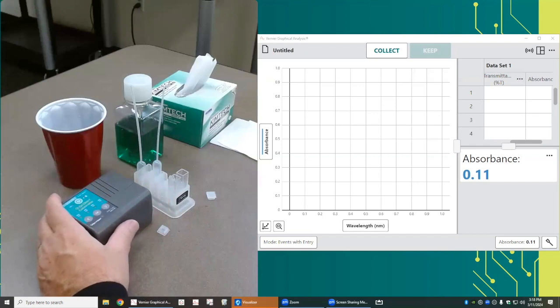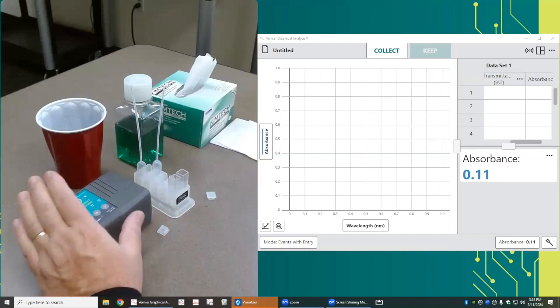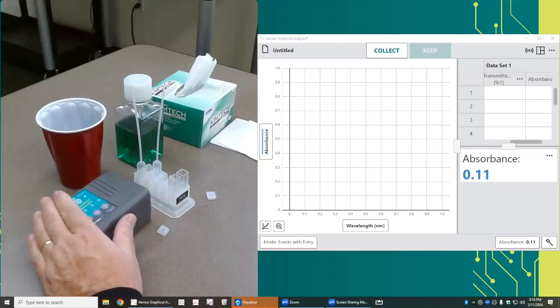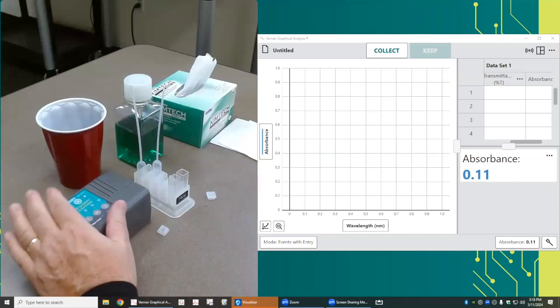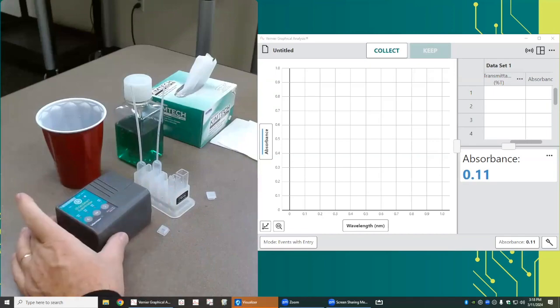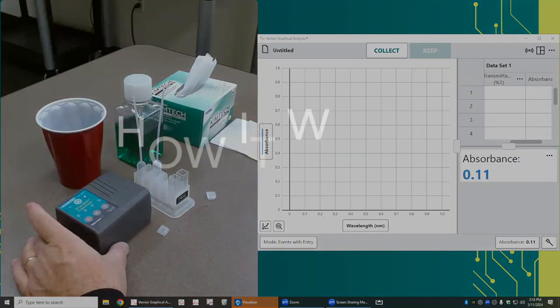When you're using a colorimeter, the first thing you want to think about is warming it up. Plug it in, turn it on, and let it sit for about five minutes.